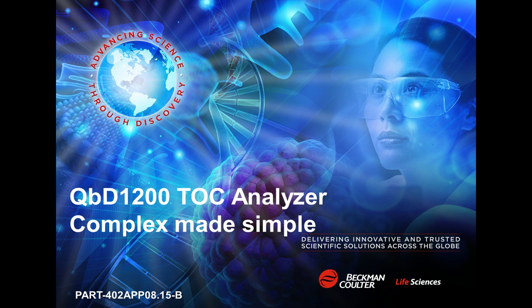ICH-Q2 has taken on special importance since it was referenced in the FDA's December 2018 guidance on their 21 CFR Part 11 data integrity compliance. A recent report shows that in 2017, almost 75% of the FDA's 483 warning letters cited data integrity issues.